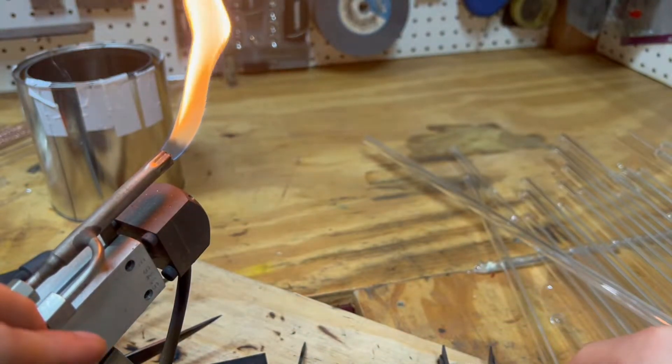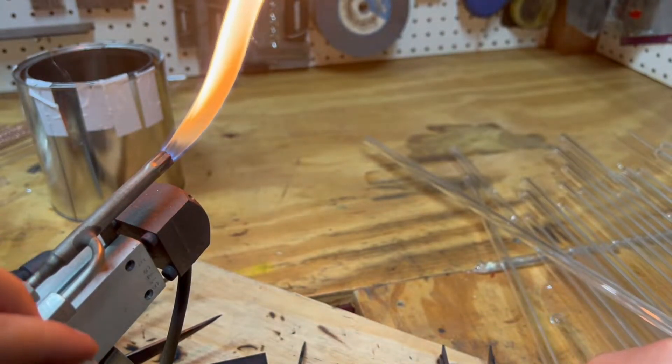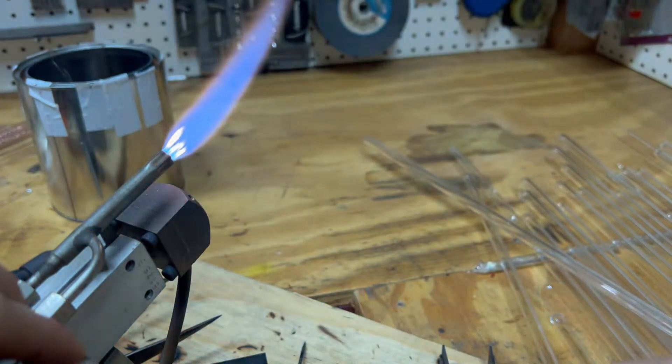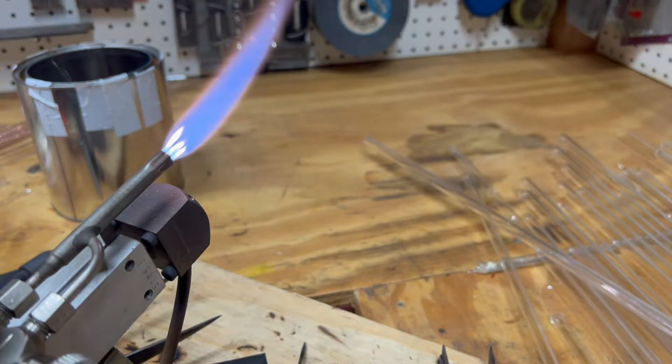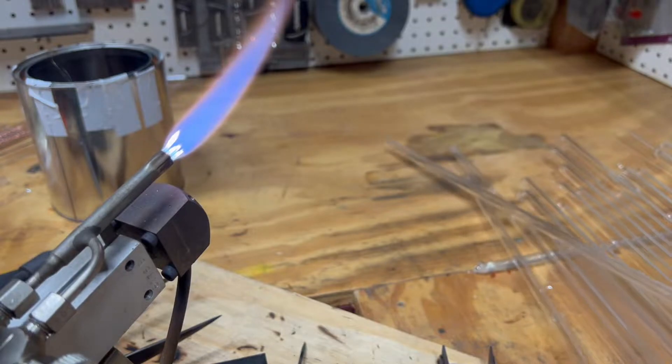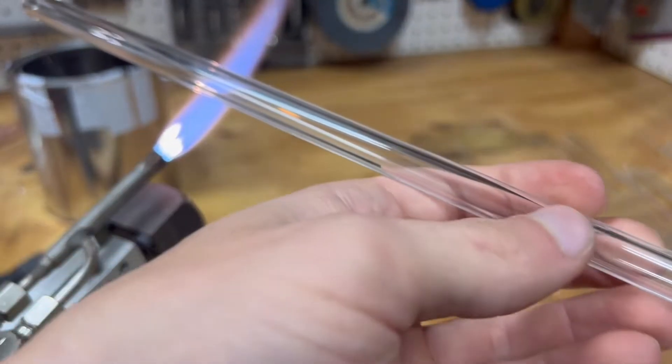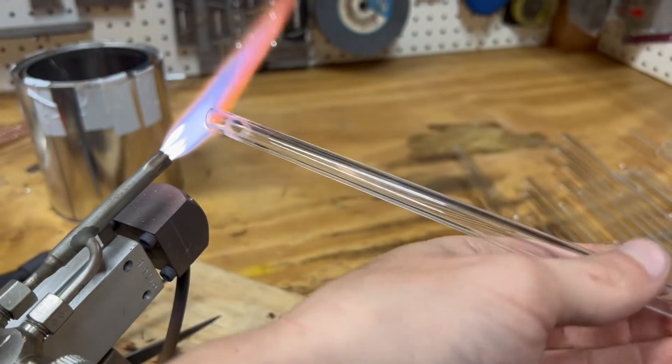Now we're ready to start. First, attach the blow hose assembly. Then start bringing the heat onto the tube. Slowly bring up to the heat while spinning. It is important to not stop spinning because this will cause it to become uneven.